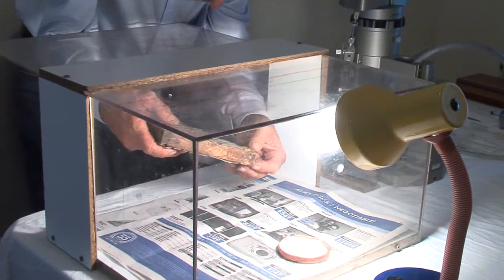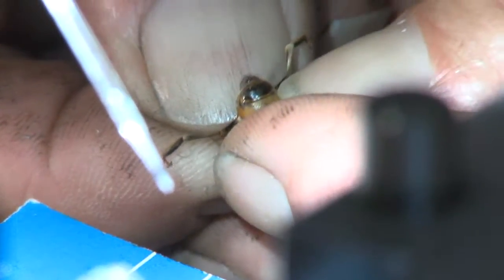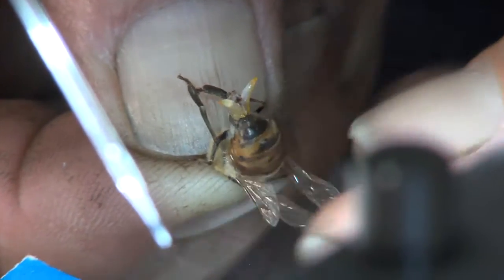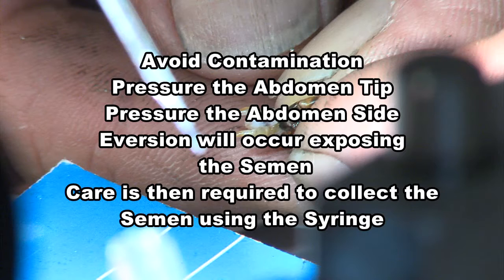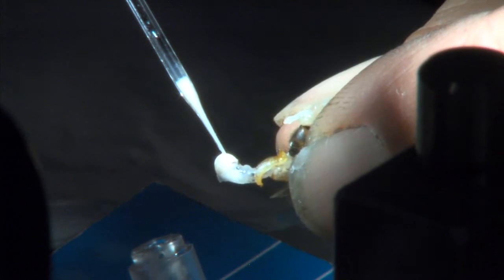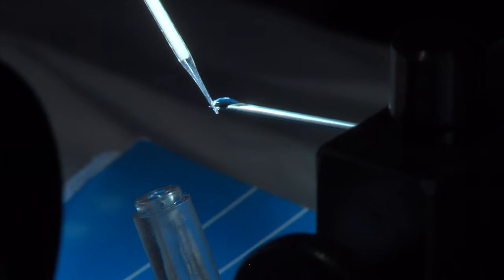Once in the insemination room, the drones are placed into a small flight cage, then caught. Each drone is held between your thumb and finger to put pressure on the tip of the abdomen to cause partial eversion, then roll your thumb and finger along the drone's abdomen to cause full eversion to expose the semen. Avoid contamination: pressure the abdomen tip, then pressure the abdomen side — eversion will occur, exposing the semen. Care is then required to collect the semen using a syringe. Hold the drone with the exposed semen and with the syringe just touching the exposed semen, skim the semen into the syringe, being very careful not to draw up any mucus. Use a saline solution to prevent drying out.